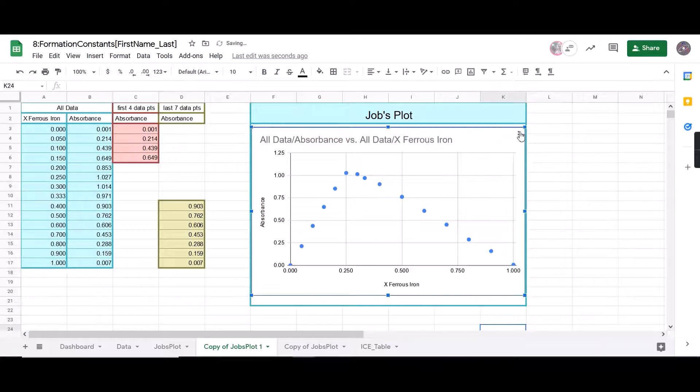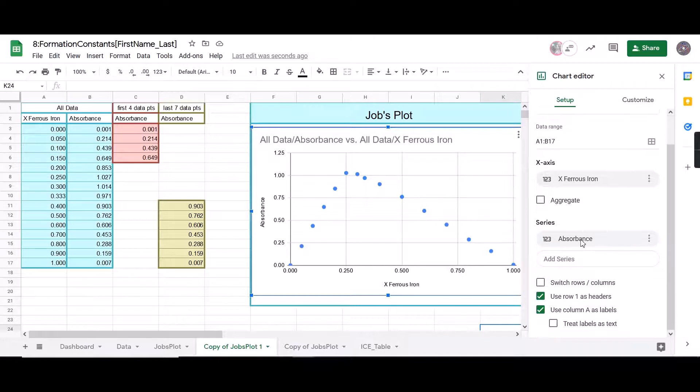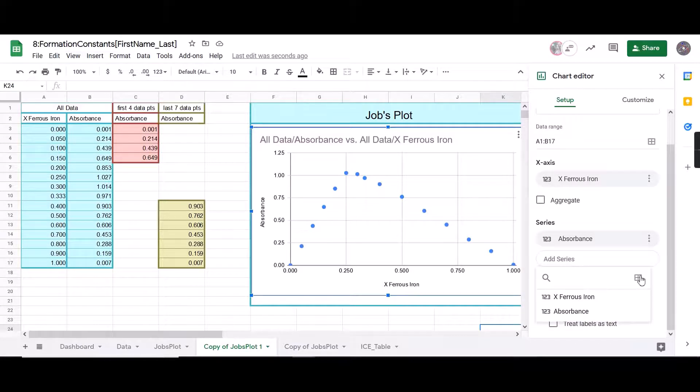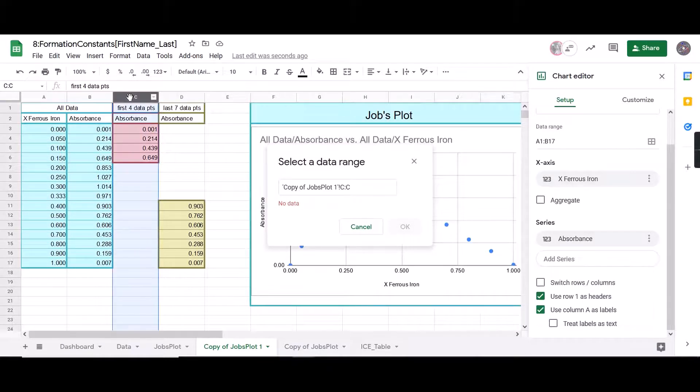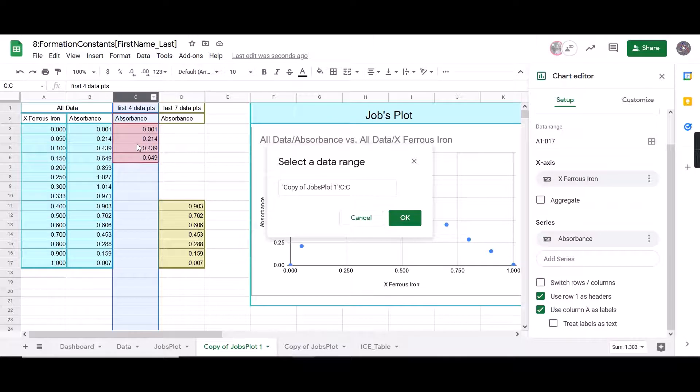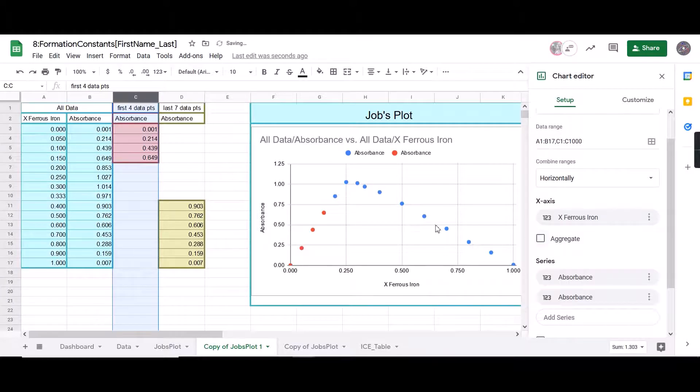So the next thing you want to do is we want to add in our other series. So we're going to come here to setup. You want to click add a series and select a data range. And then the thing that's important here is you want to select the entire column. If you select just the numbers, it's going to mess up whenever you insert into your chart. So you want to make sure you select the entire column. Then you'll press OK. As you can see, you can see our red dots right there.